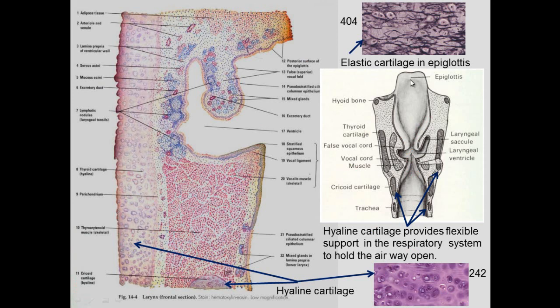Coming down from the oral cavity, the epiglottis regulates flow of air down to the larynx and trachea versus the esophagus. It has elastic cartilage with elastic fibers and chondrocytes visible in the matrix. Most of the respiratory system, however, has hyaline cartilage, which provides flexible support — holding the airway open yet not rigidly, allowing some adjustment.